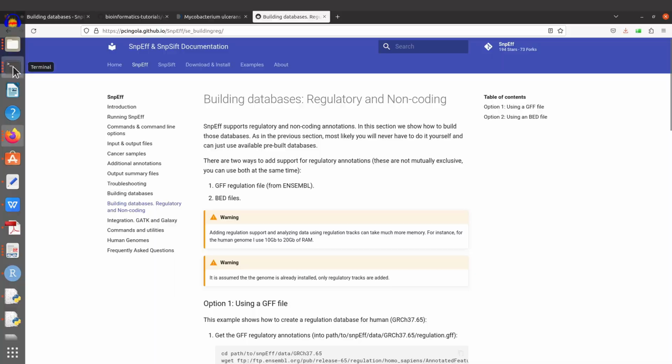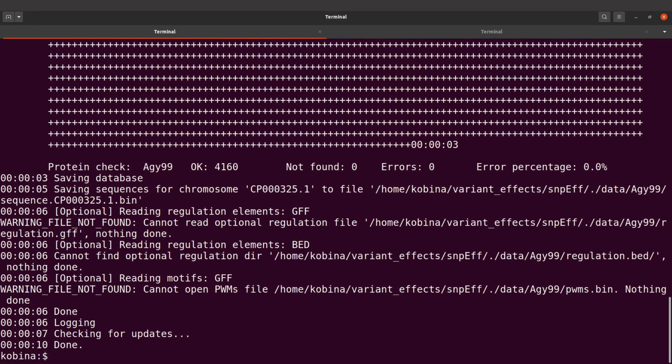So now we can proceed. For us, we are looking at a small genome, and so the Genbank file is okay for us. If you have a warning, you can check it out, read about it, look it up, and if it's not anything major, you can leave it. Some of the warnings can actually prompt you to add extra or additional information. So just check them and then decide whether they are worth following up or not. Okay, so now let's proceed. Let's clear the screen and then let's continue.